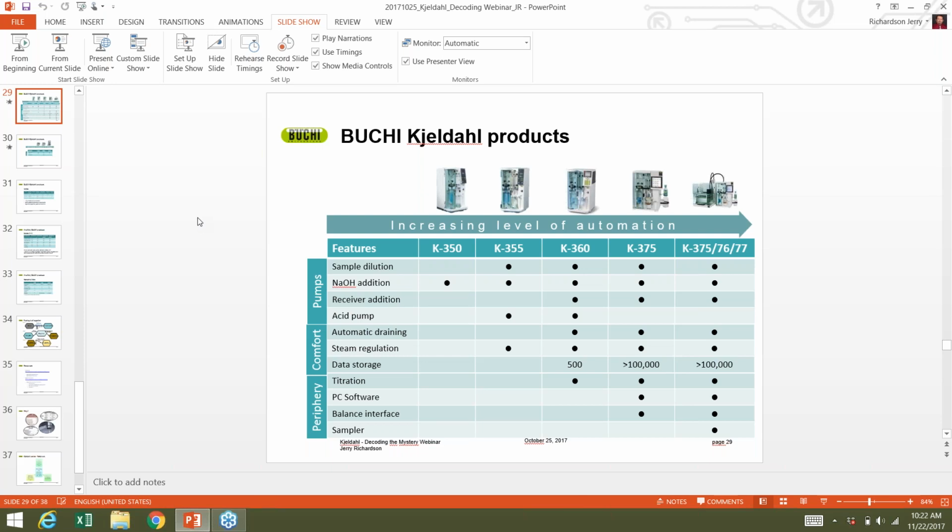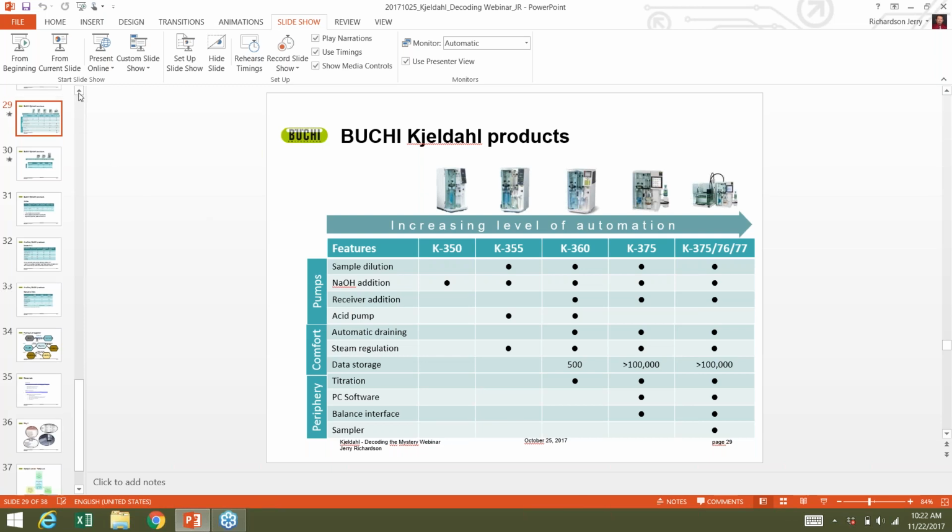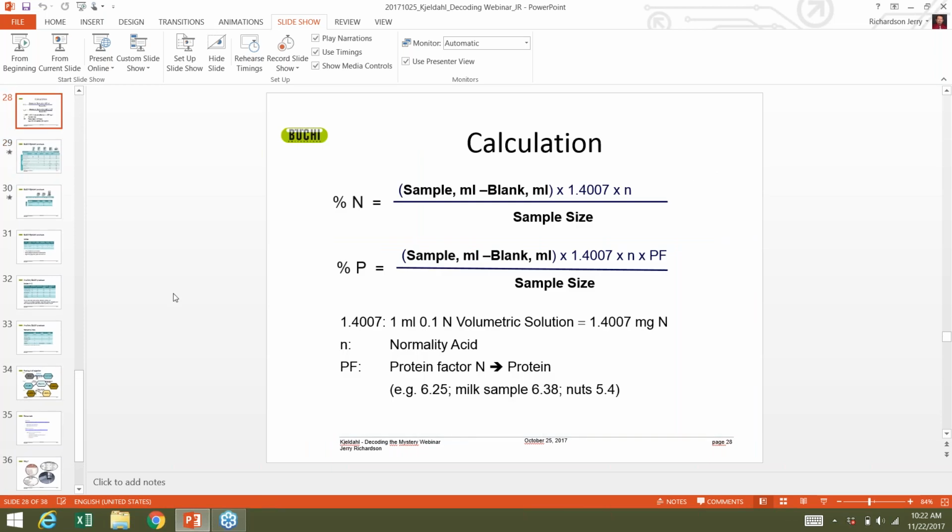All right, so the next question is how is protein factor calculated for specific proteins? Going back to the conversation as we were talking about the calculation, those protein factors are conventions that have been around for a long time. They've been around since longer than I've been alive, and so they're still used today for determinations that were done in the 1930s, 40s, or 50s, depending on what it was. And so those conventions are based on the protein source.